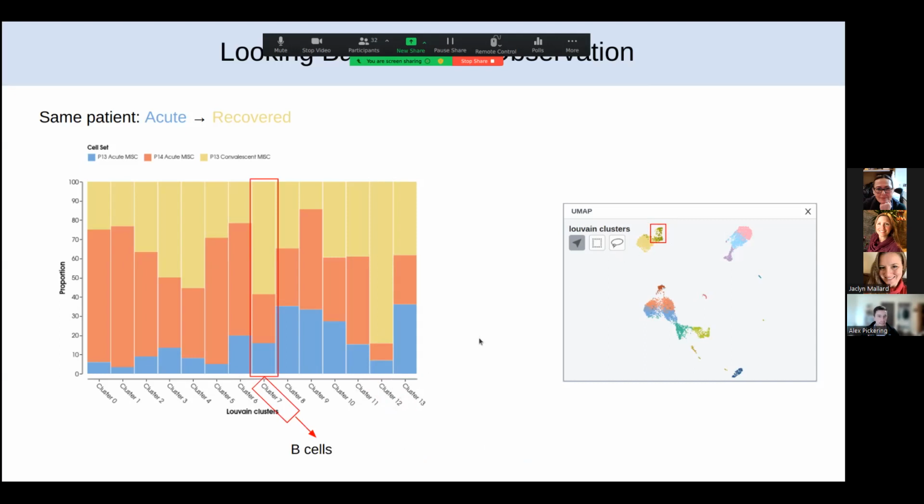And this particular B cell cluster expresses high levels of IgG antibody genes. You might have had a chance to look into this if you finished early and did the bonus exercise where you were comparing to cluster number 2. That cluster number 2 is also a B cell cluster, but it has high levels of immunoglobulin M antibody genes.